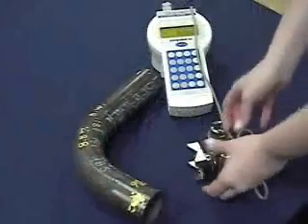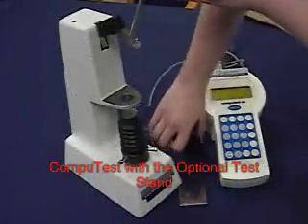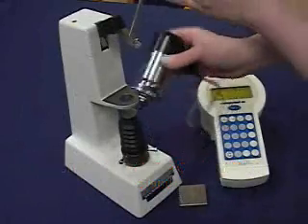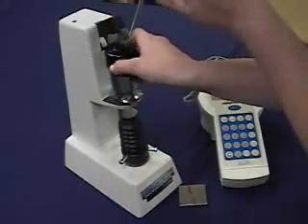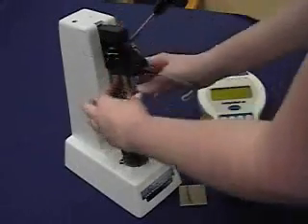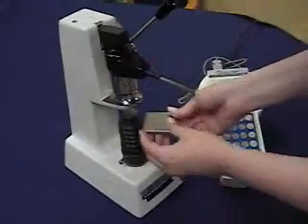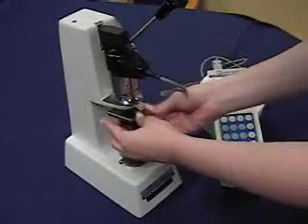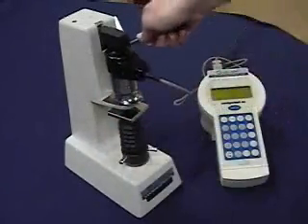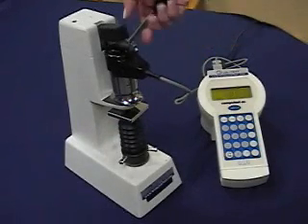As an optional accessory, you can obtain a test stand in order to test components with small surfaces and irregular shapes. This way, the CompuTest can be used as a benchtop hardness tester if needed. Just place the test head in the stand. Adjust the height of the sample holder in order to place the sample close enough to the indenture. Then, by using the handle in the stand, press the diamond indenture in order to achieve the test.